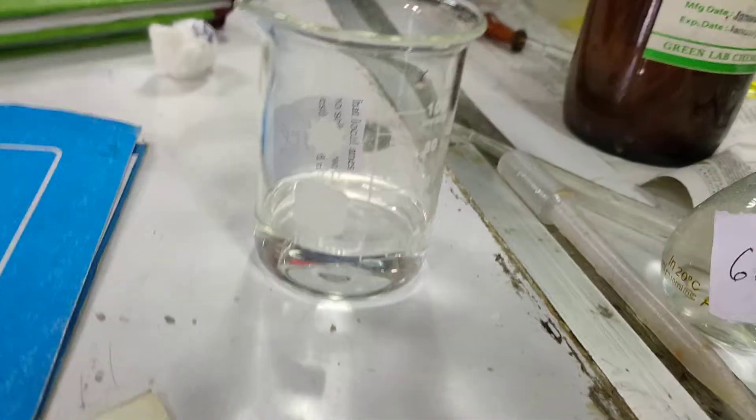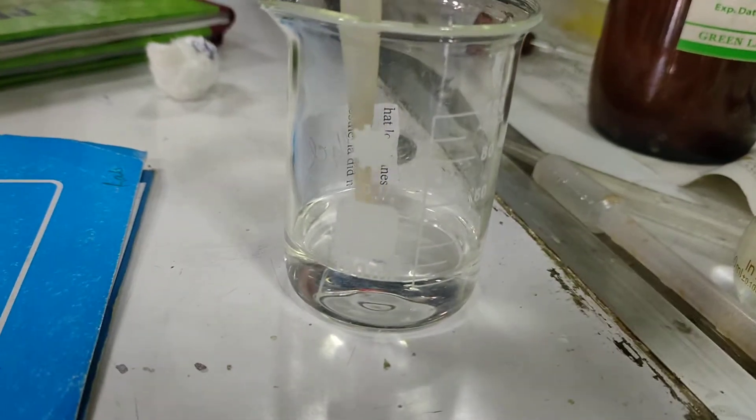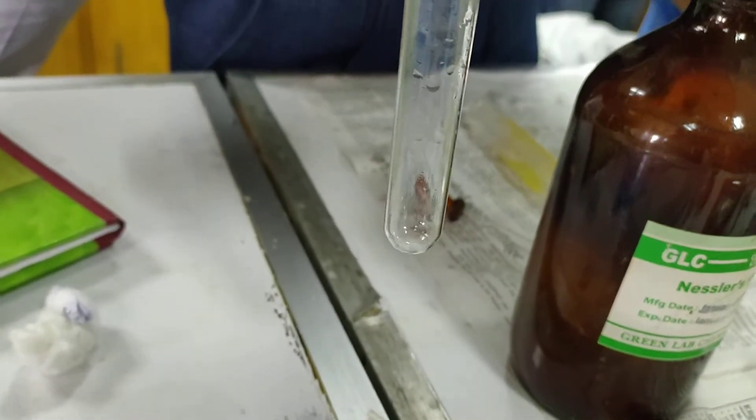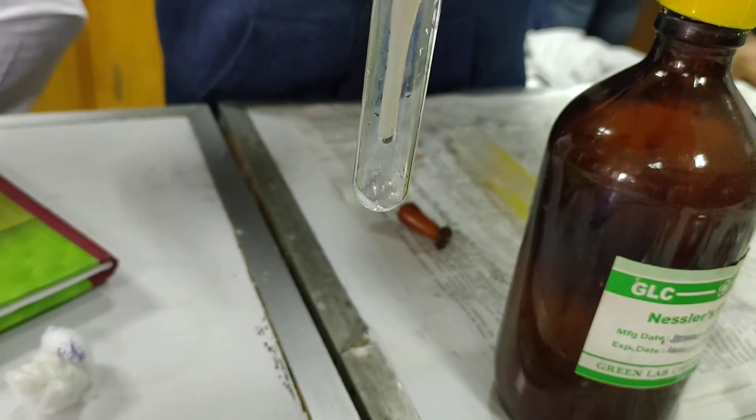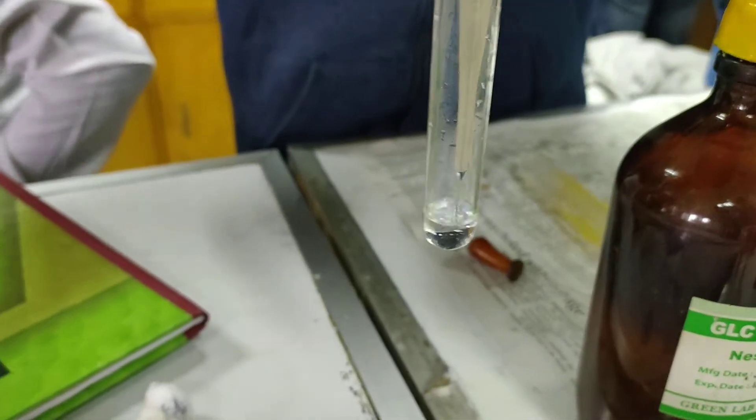We are going to test for the ammonium cation, this is a group 5 cation. At first, sample solution is being taken in the test tube.